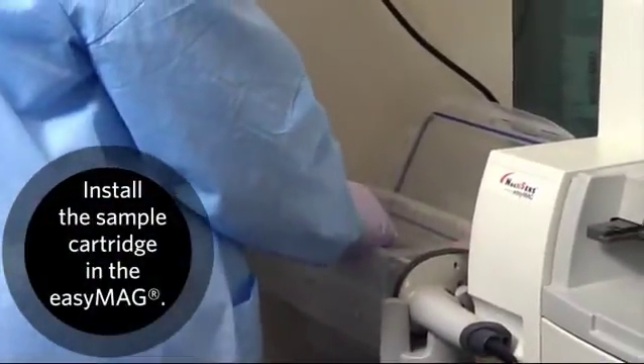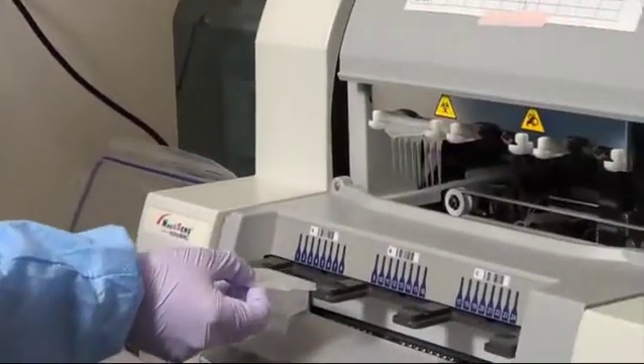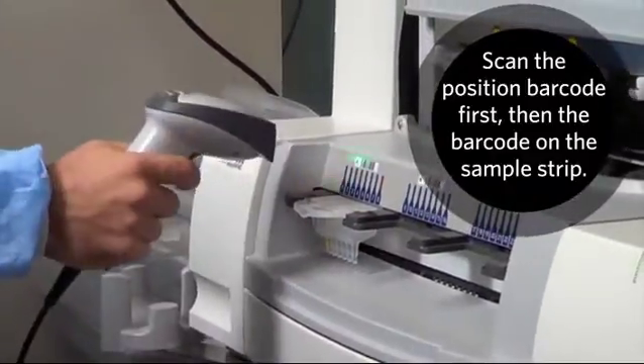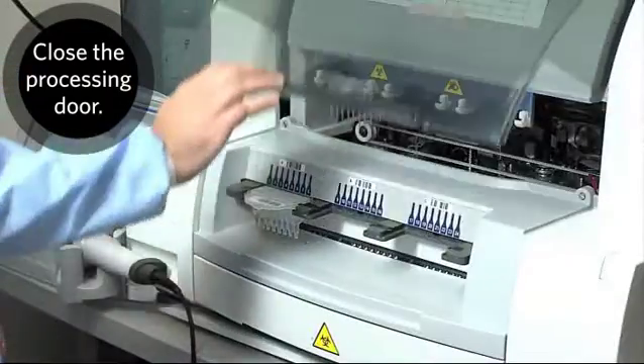Install the sample cartridge in the EasyMag. Scan the position barcode first, then the barcode on the sample strip. Close the processing door.